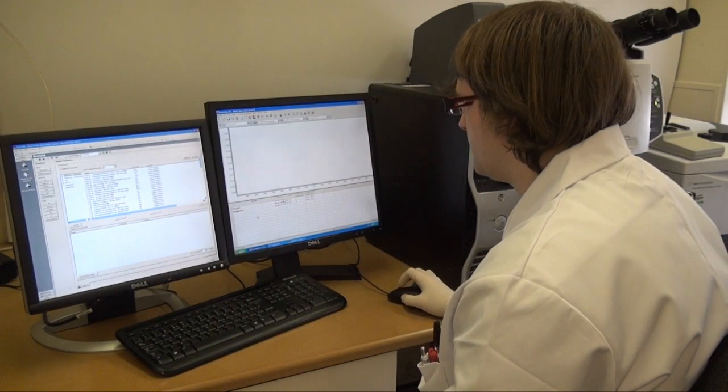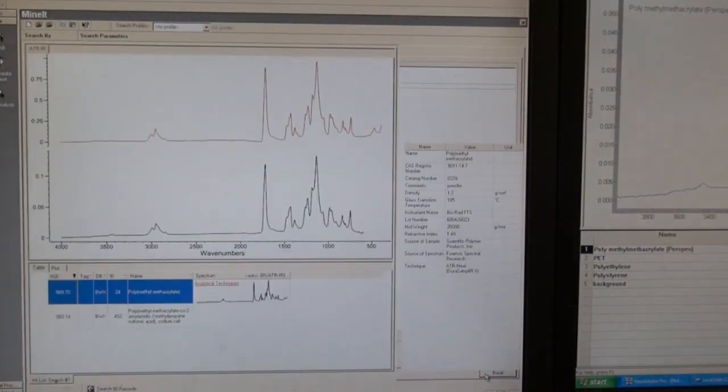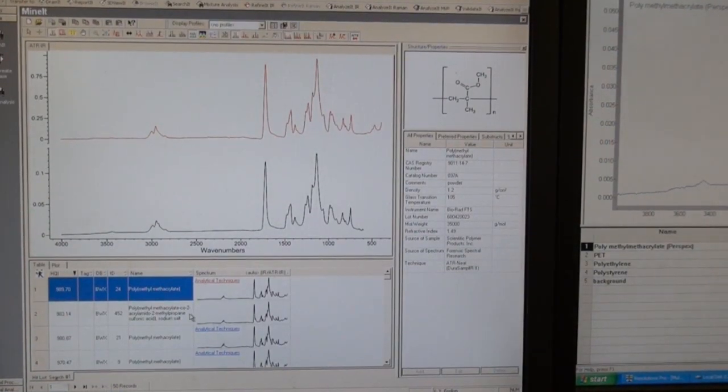Results are displayed on the PC monitor. The computer then searches its library of known spectra of different materials to make an identification.